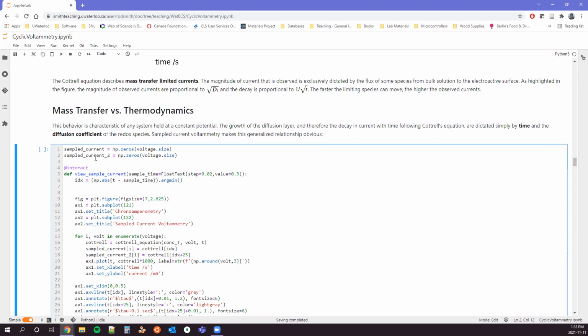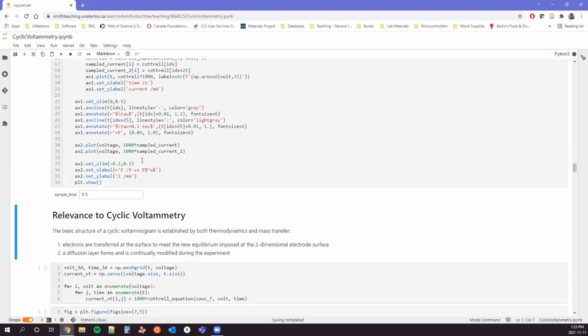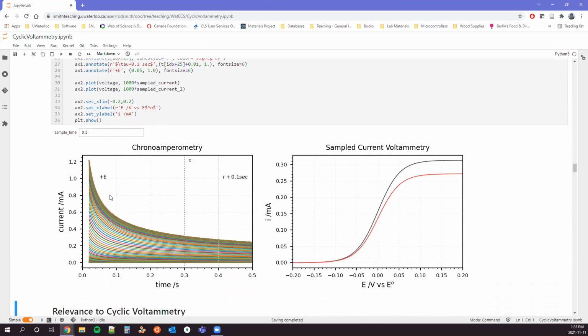You step to a different voltage, you let the current decay. And so when we're doing that, we can see what's shown down here. This left side shows all of those potentials, and it's stepping from basically a cathodic overpotential to an anodic overpotential. And we're going from the bottom all the way upwards.